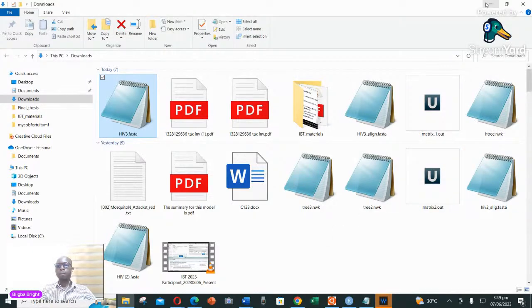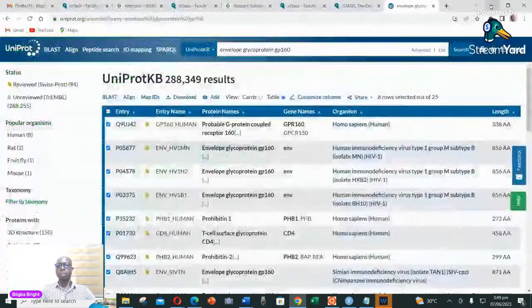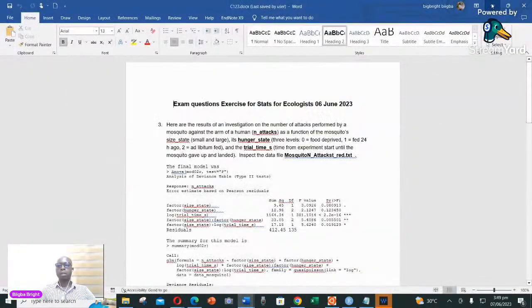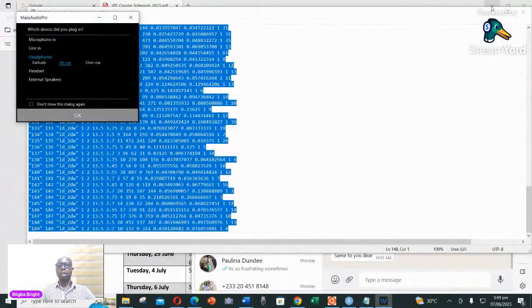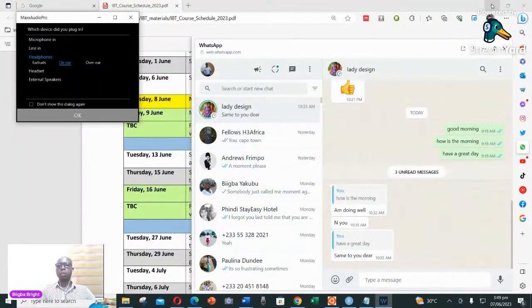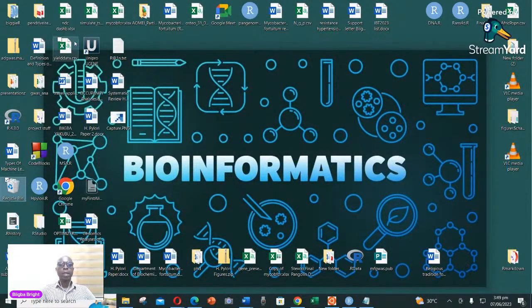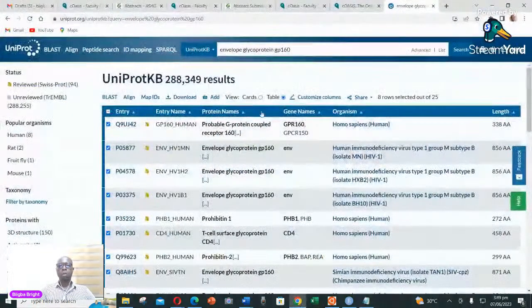So I'm going to minimize this and get to my desktop. So I am here on my desktop. You can see this is my Unipro UGENE. If you don't know how to get this, try to download it.